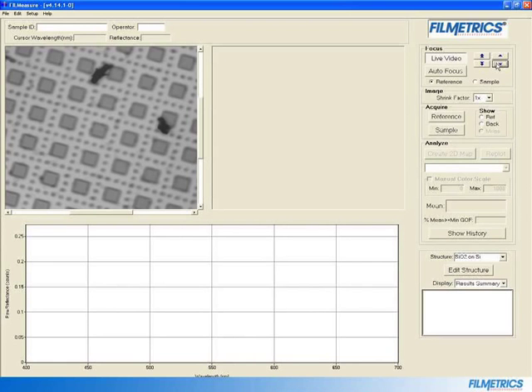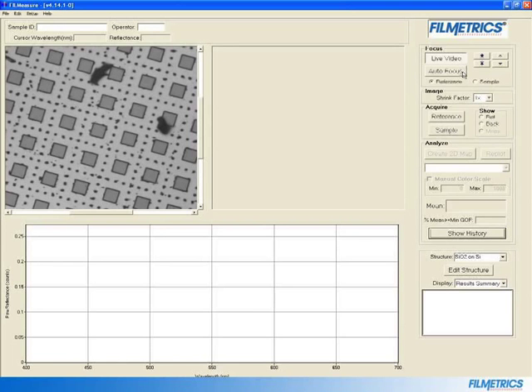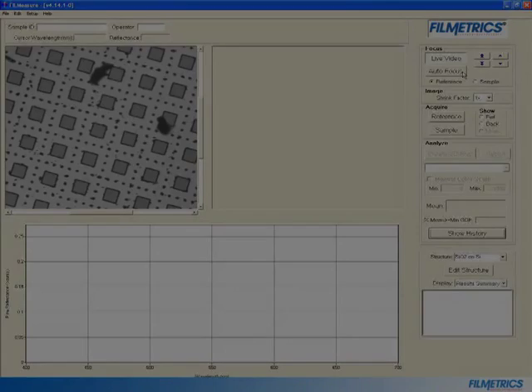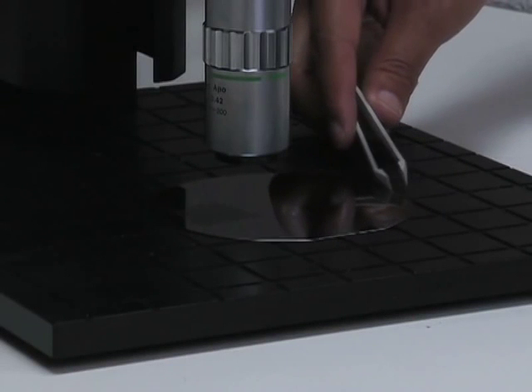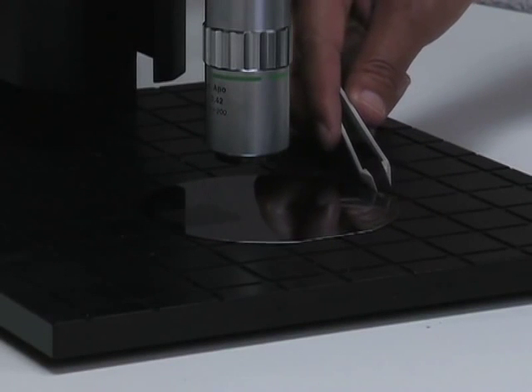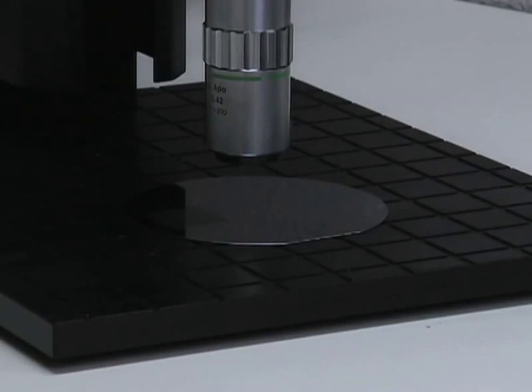Once the image is nearly in focus, you can click on Auto Focus to allow the software to automatically focus the sample. Move the focus reference wafer so that the reference portion is shown in the Live Video.